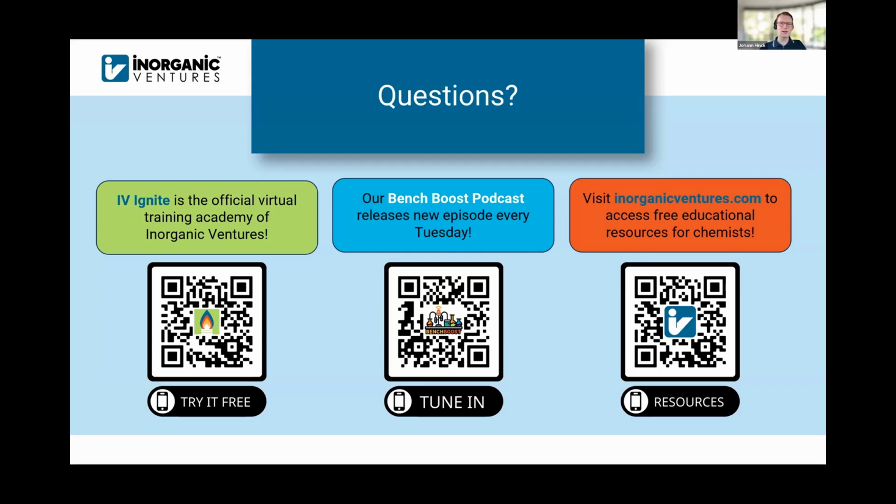Yeah, that's a great question, and I'm glad you asked that because I meant to talk about this on the ammonia slide, and I felt like I was forgetting something. So thank you for that. The ammonia reagents that we have made through Inorganic Ventures right now are for unacidified samples. If you look in the method document for ammonia, sometimes there's information about preparing for unacidified samples versus acidified samples. It sounds like you're using acidified samples and adding that sodium hydroxide into the DCI reagent to account for that extra acid in the samples, which is exactly what you should be doing.